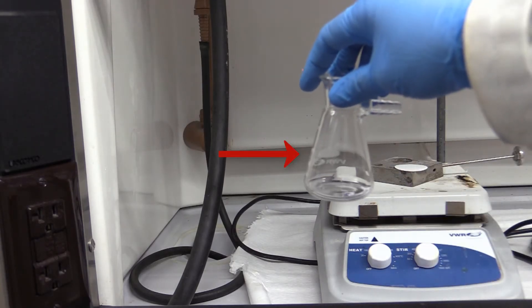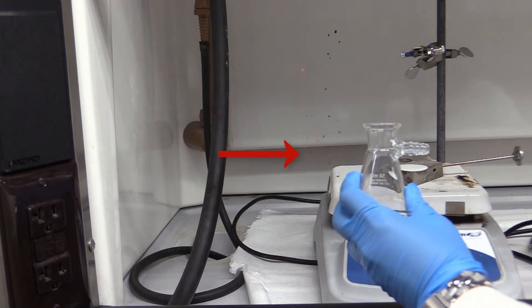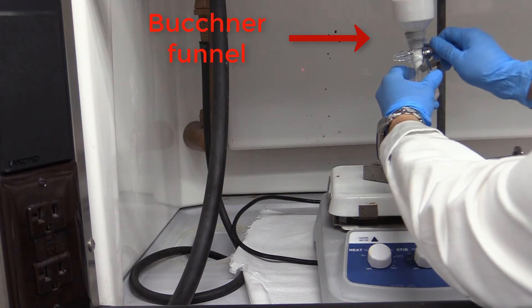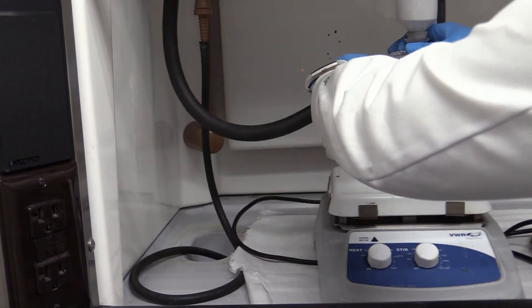When you are ready to filter, grab the filter flask and the Buchner funnel. Clamp the flask into the stand so it doesn't fall over while you are filtering. Attach the black rubber hose from the vacuum to the arm of the filter flask.